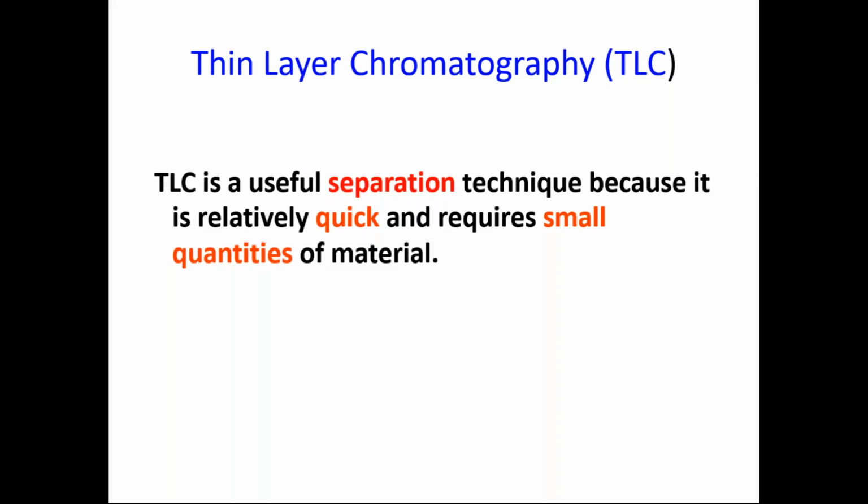Although very old, it is still used extensively, and the advantage is it is quicker than paper chromatography, and you need relatively smaller quantities of the material. And now automation of the thin layer chromatography to high performance thin layer chromatography or HPTLC has made this technique even more versatile.